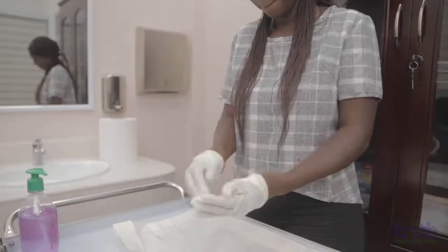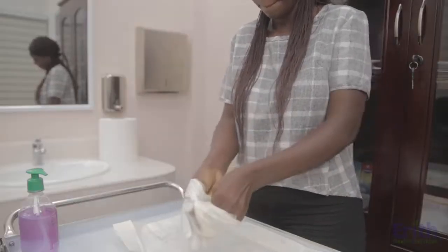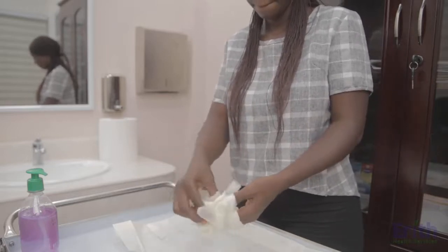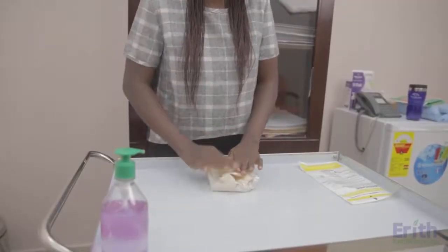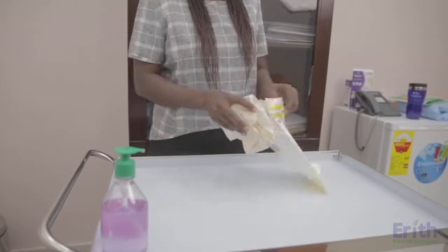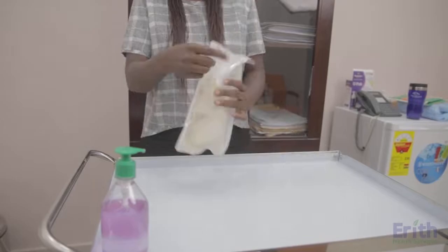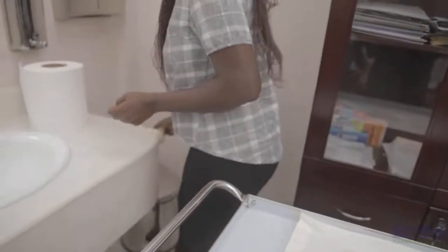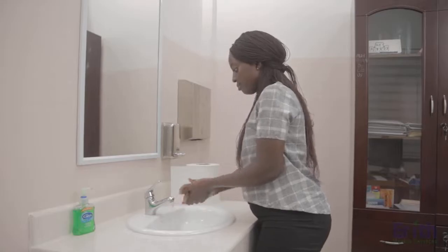Step 3. Gently pull off the two gloves at the same time, being careful to touch only the inside surface of the gloves with your bare hands. Step 4. If the gloves are disposable or are not intact, dispose of them properly. If they are to be processed for reuse, for example industrial gloves, place them in a container of decontamination solution. Wash your hands immediately after the gloves are removed.